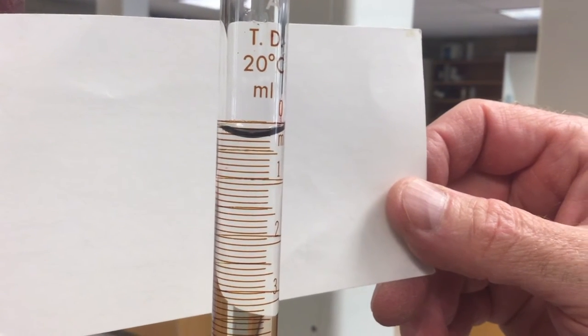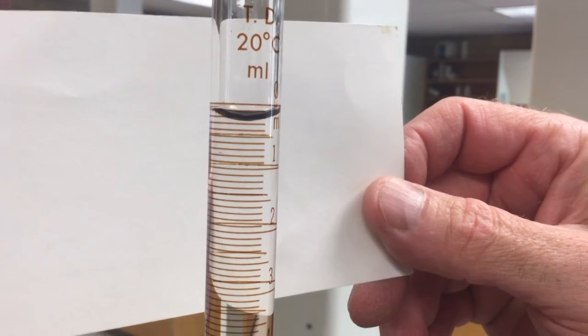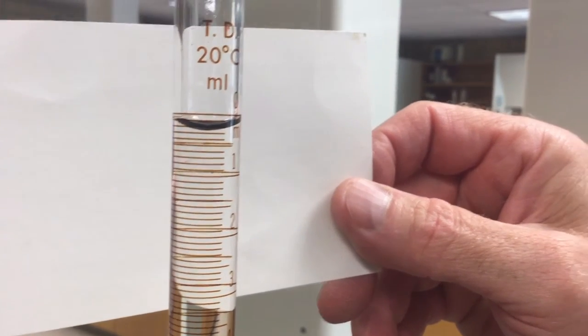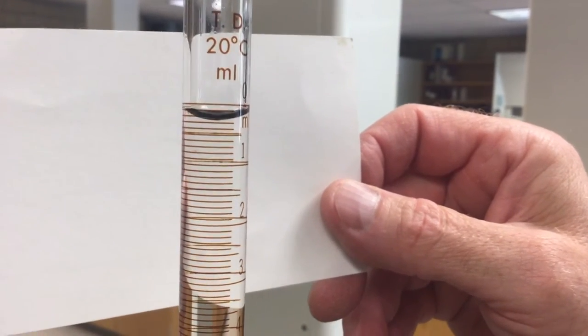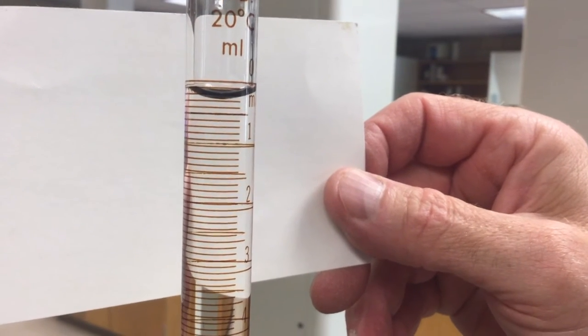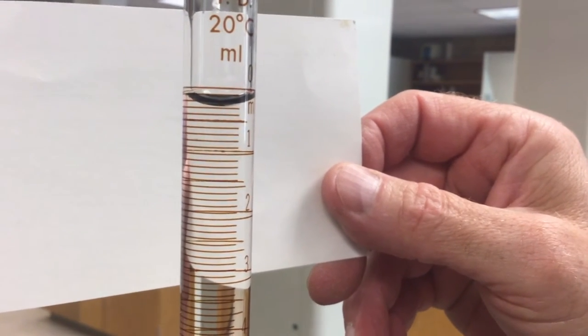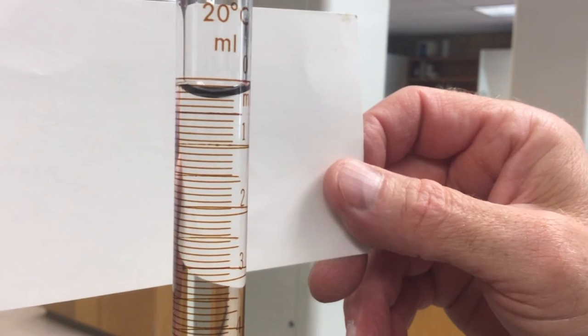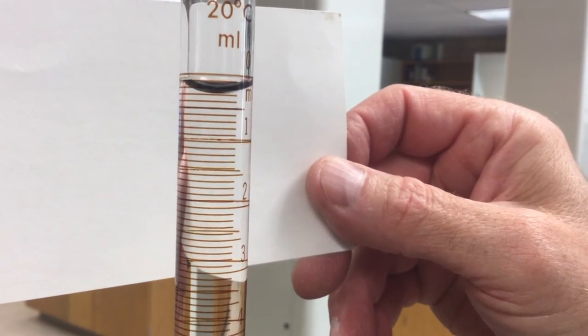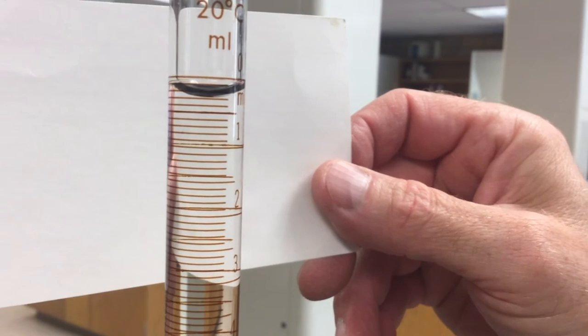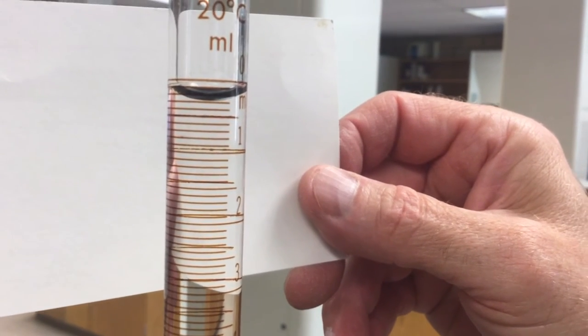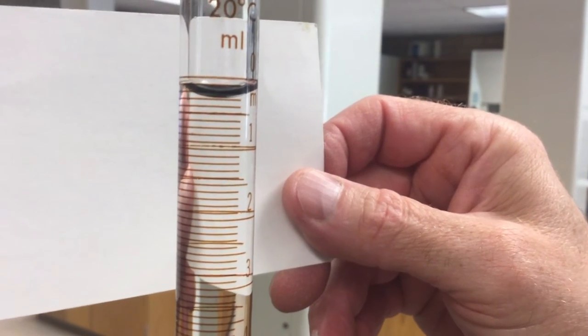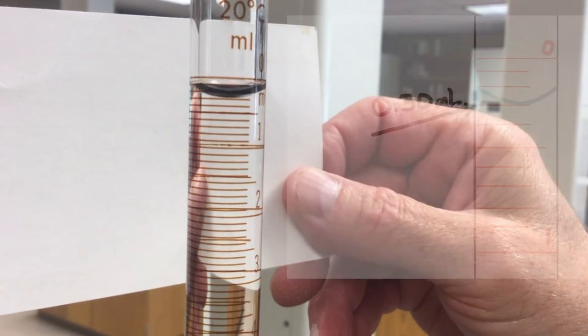When using a burette, you want to measure the volume from the top down. Notice that 0 is at the top, 1, 2, and 3 are below it, so we're measuring marks from above. When we measure, we want to use the bottom of the meniscus. The meniscus is the curved part of the liquid, and we read from that. You'll notice that this particular volume is 0.3 milliliters exactly.